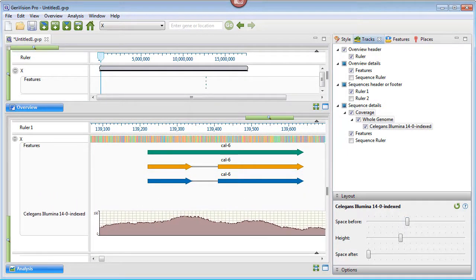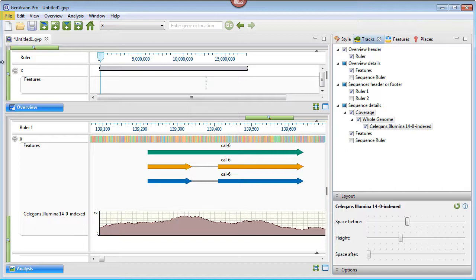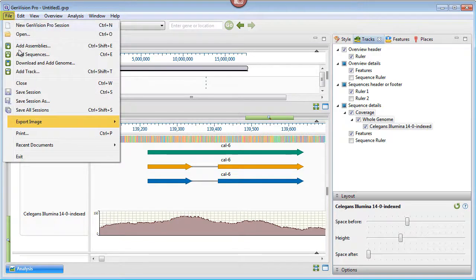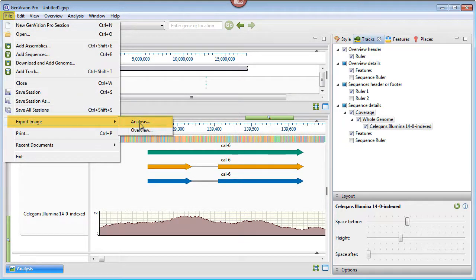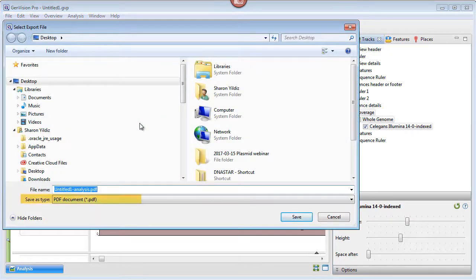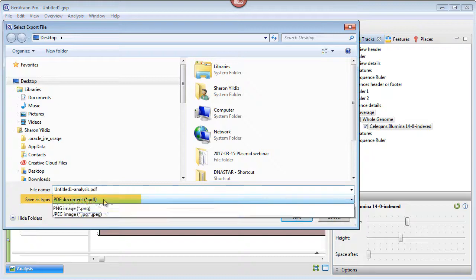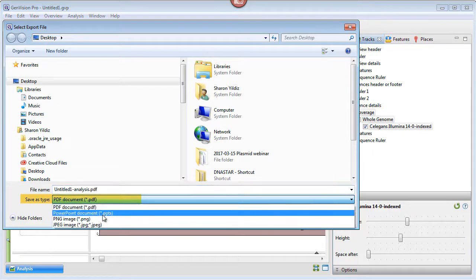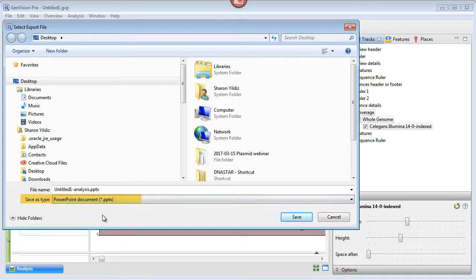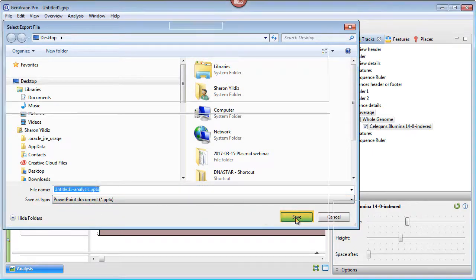Now I'm ready to export the image using File, Export Image, Analysis. For the Save as Type, I'm going to choose PowerPoint Document and then press Save.